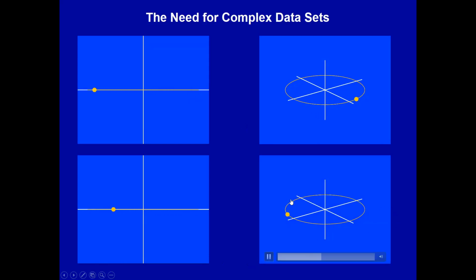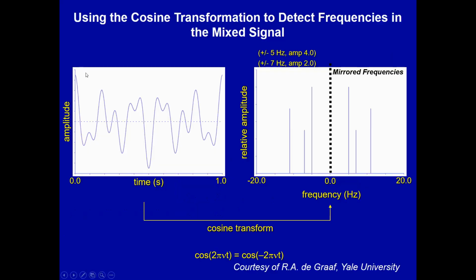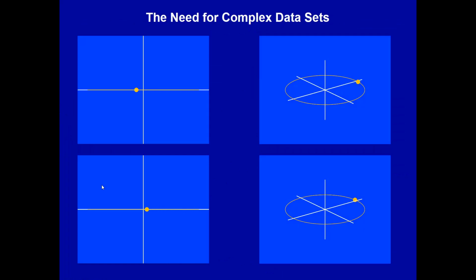Now, suppose we have a ball going counterclockwise and we look at it exactly edge on. Again, we can't tell anything about it. We just see the ball go back and forth and back and forth. And on the left, these perspectives are equivalent to this. We are watching XY magnetization precess in the XY plane, but only with the vantage point of the very edge. We can't see whether things are precessing clockwise or counterclockwise. We just know that the signal amplitude is going up and down.